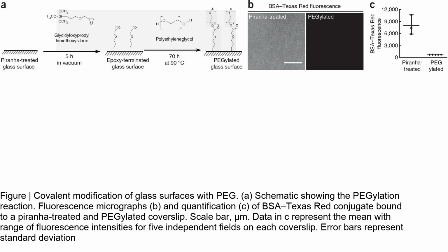This passivated surface allows for the precise control of membrane curvature and the investigation of how membrane curvature influences the binding and scaffolding of proteins. The data in Figure 2 also provide a baseline for comparison with subsequent experiments in the paper, where the effects of protein binding and membrane fission on the pegylated surfaces are examined. Overall, Figure 2 establishes the foundation for the subsequent experiments and analysis in the paper.